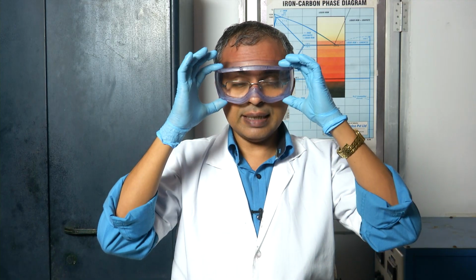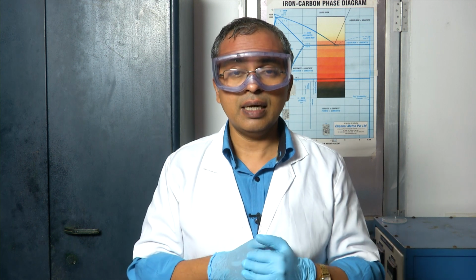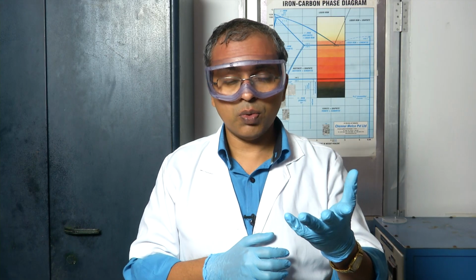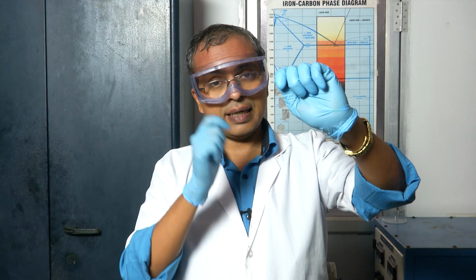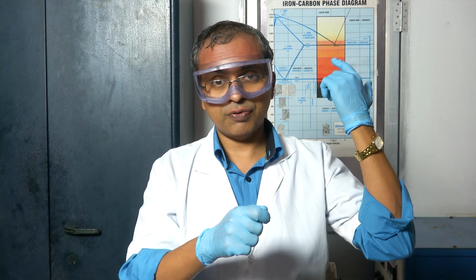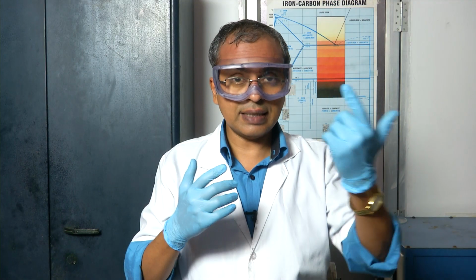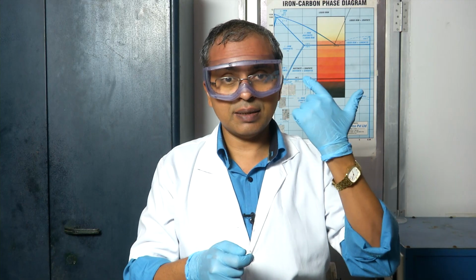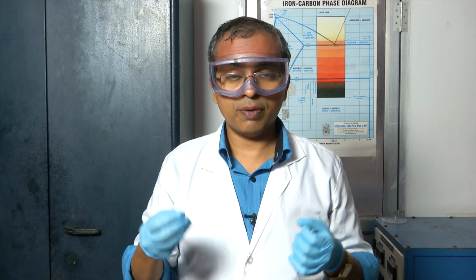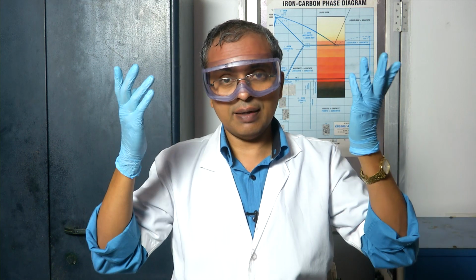And in fact, this is necessary not just for working with chemicals. I highlighted the aspects of it that would help you in the case of a chemical spill, but even if you are putting a nail on a wall, the common thing that happens is as you are hitting the nail, the nail slips and it flies off, and when it flies you have no control on where it flies. It could easily strike the person's eye. Many accidents happen where they are just striking a nail and it strikes the person's eye, and this is a simple device which just costs a few hundred rupees or maybe just a few dollars if you buy it in some foreign location, that provides your eye with great level of safety.